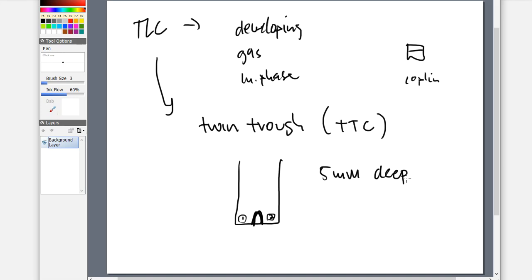Now, keep in mind that based on the dimensions we've talked about, as far as the monograph goes, there is a starting point on the plates. And these starting points were 8 millimeters from the bottom. So if I'm using some automated instrumentation, manufactured in a way that keeps these dimensions in mind, then we know that the pharmacopoeias and other regulatory sources will very often tell us to begin the band application at 8 millimeters high from the bottom.